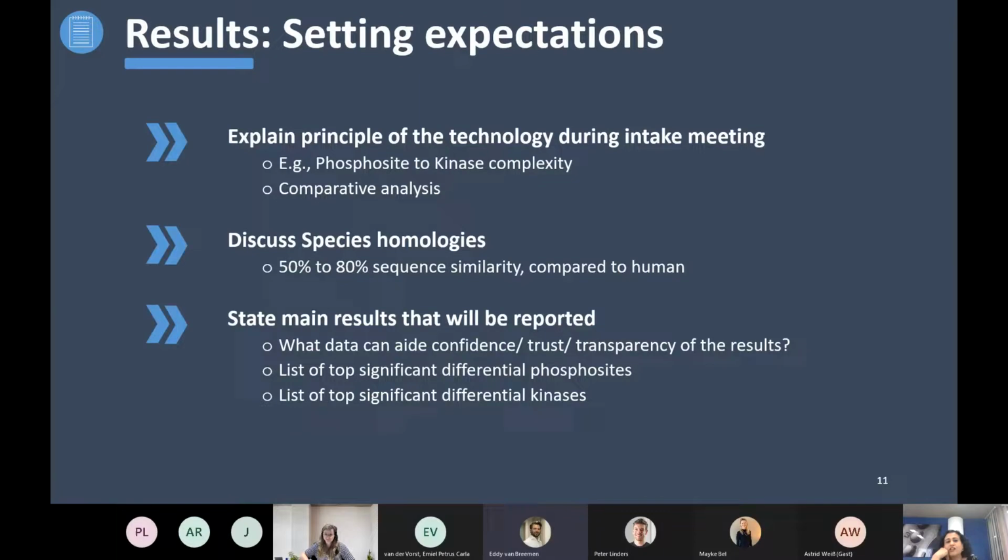If you know some very good mouse post-translational databases, we would love to hear that from you. Because we are also constantly learning and updating things. So I love the initiative. It's also on my agenda, but it's good that we bring it up again. Within PamGene, just to let you know, we have a team called the Knowledge Integration Task Force, and we are constantly meeting in this task force to update databases and things. So this was already one of the projects in our pipeline.